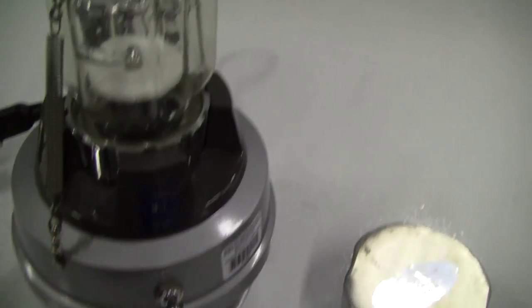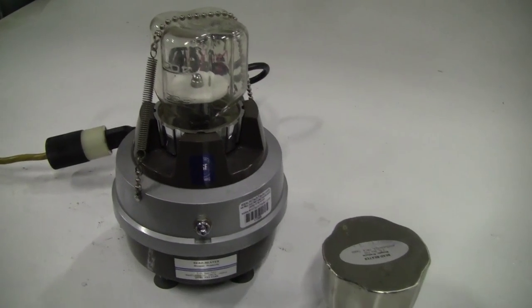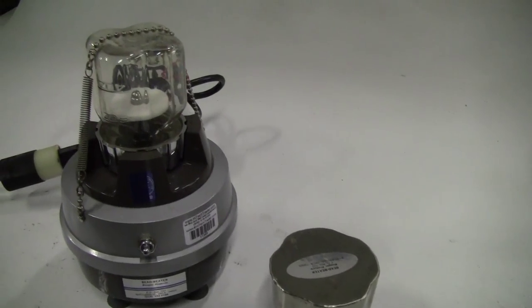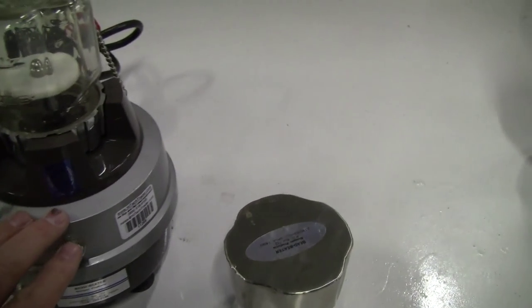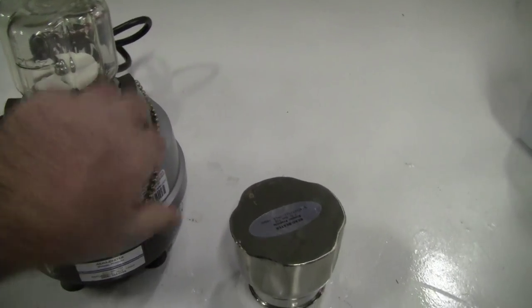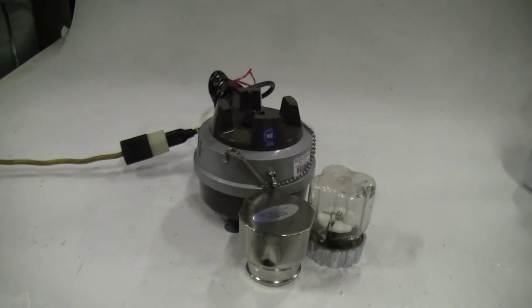Let's start it up. This goes under there and that's pretty much it.